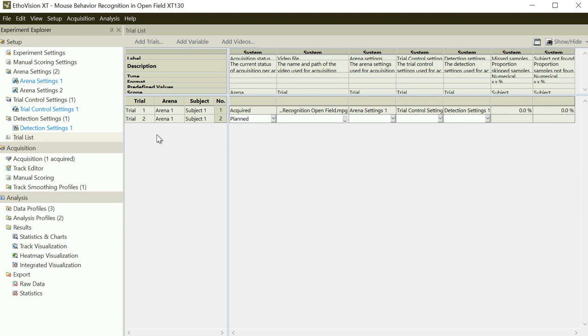You will probably use many animals as your sample, and you will acquire so much data even in one day.